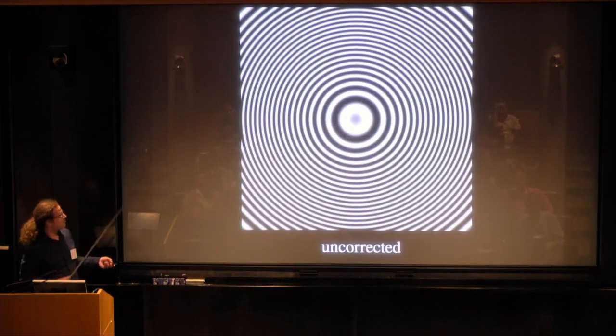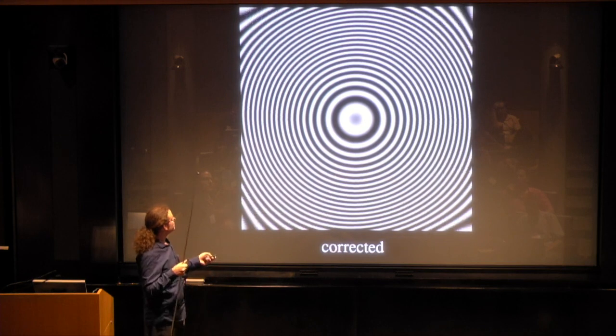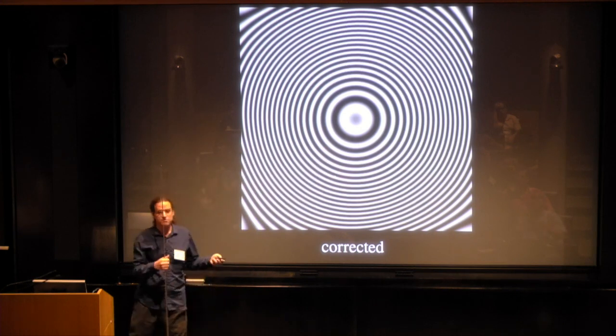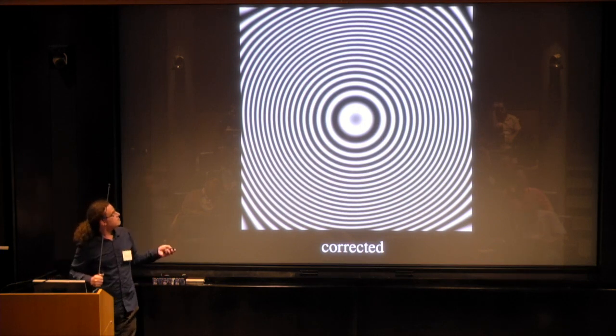And when you look at the corresponding CTFs, so here you see the original one and the distorted one. So note it becomes slightly angled up here. But there's very little change around the origin. So you could never measure this by just looking at Thon rings. Those are way too weak. You need to accumulate the data for an entire data set to estimate those.